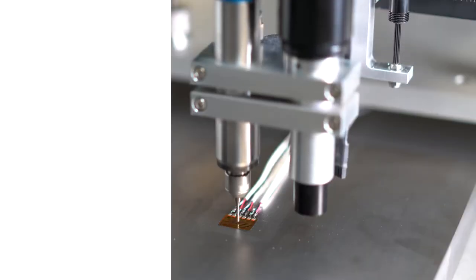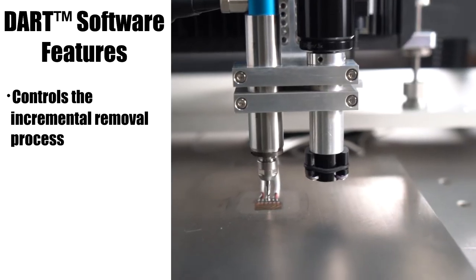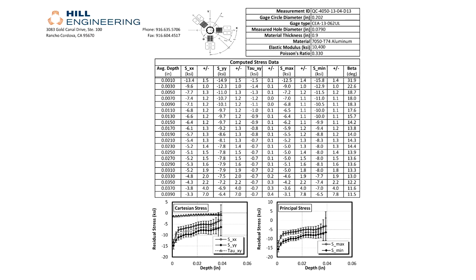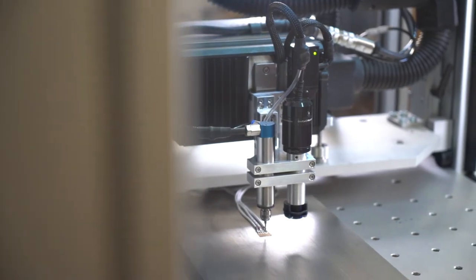Following setup, the software automatically controls the incremental material removal process, acquires the experimental data, computes residual stress, and outputs a test report. The entire process is significantly more efficient than other available tools.